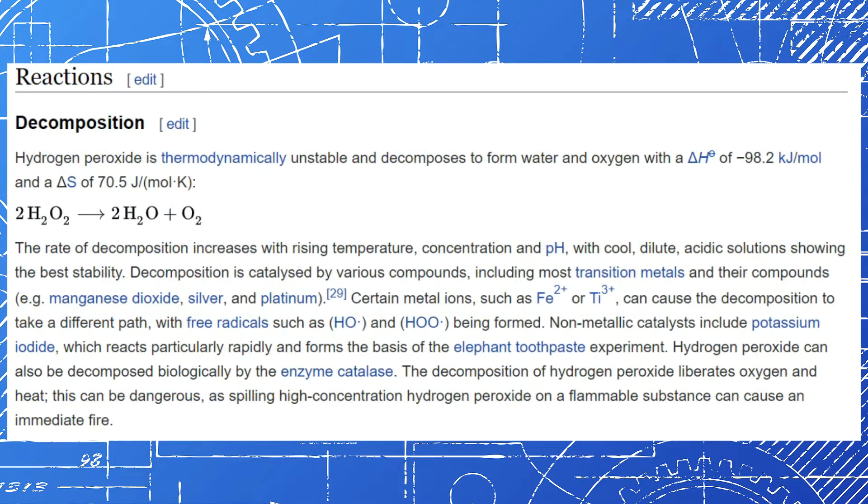Now, for this reaction, you're going to need at least about a 3 to 1 ratio of hydrogen peroxide to battery acid. And in general, a little bit extra hydrogen peroxide is good to ensure there is enough to react with all the battery acid. Then, any excess hydrogen peroxide will naturally decompose due to its inherent instability.